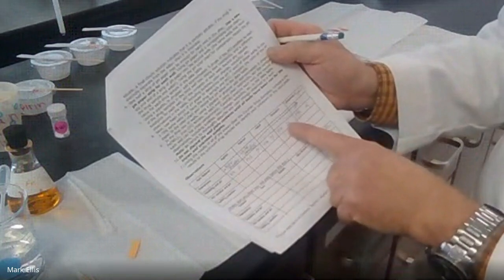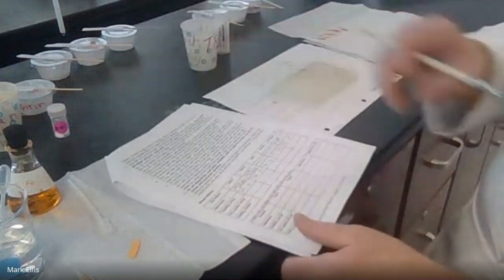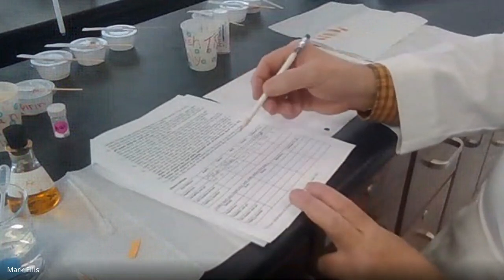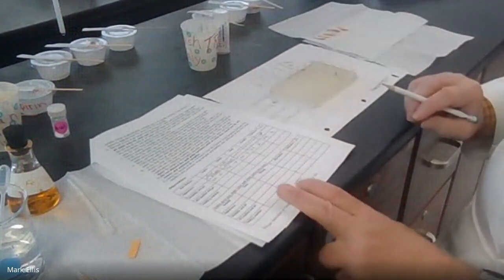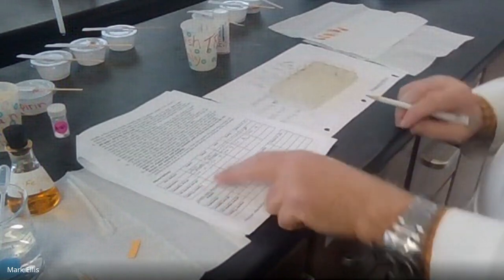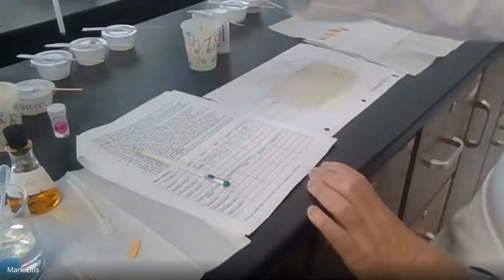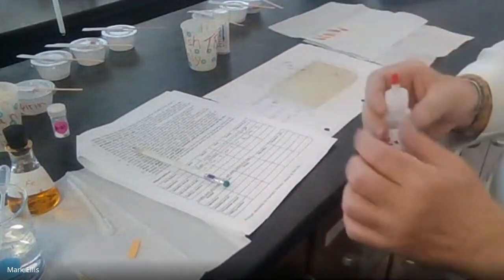So far, it looks like it could be aspirin or Excedrin. But that's not enough. I gotta figure it out. So far, those are the ones that it may be, but let's keep testing. Next, I'm going to drop about 5 drops of hydrochloric acid and give it a little stir and test the pH again.